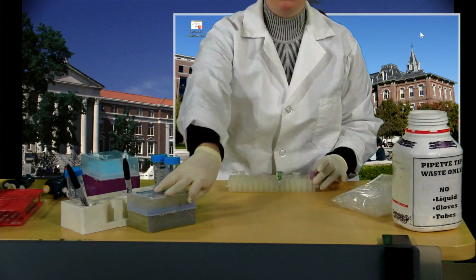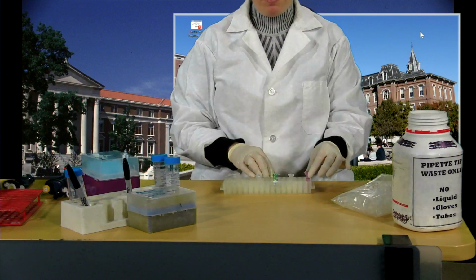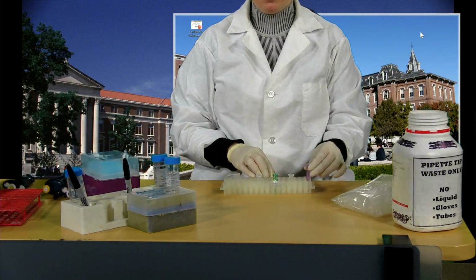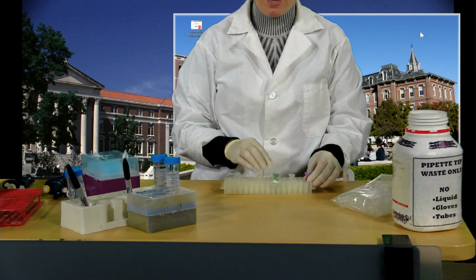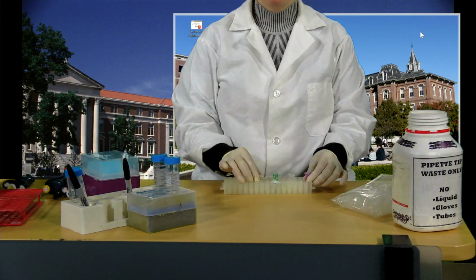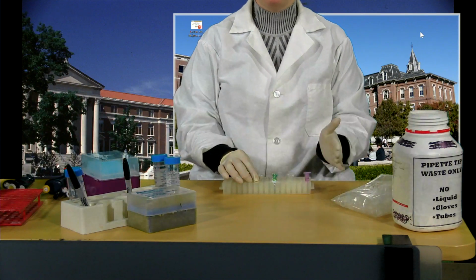You have a little bit more leeway here in terms of the start time of the reactions. For example, this reaction where I added my first sample would have started maybe 30 seconds ahead of this reaction. Typically, if you're doing a 1 minute assay, you'd be quite concerned with that difference in time.